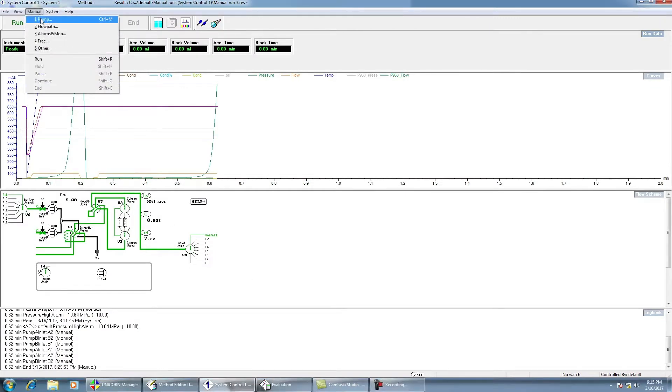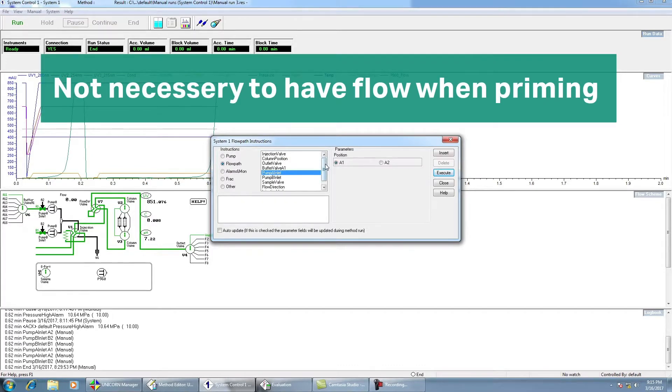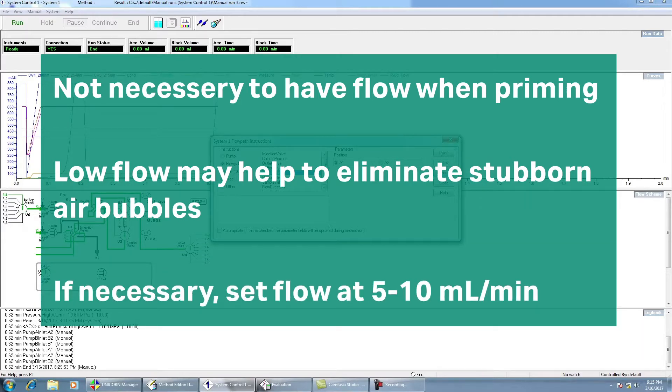In Unicorn, select the buffer inlet line you wish to prime from the flow path in the manual commands in the system control window. It is not necessary to start a flow when priming the pumps, but it may help to remove stubborn air bubbles trapped in the pump heads. If desired, set a flow rate of 5 to 10 milliliters per minute after selecting the buffer line and start the pump running.